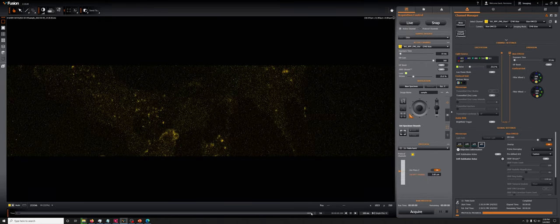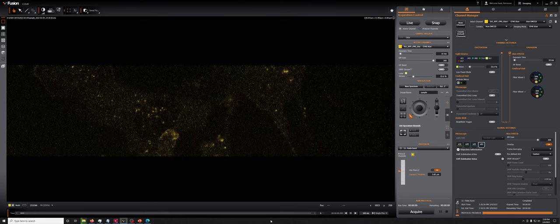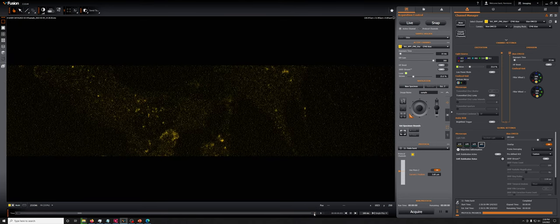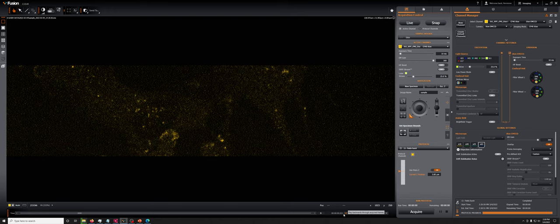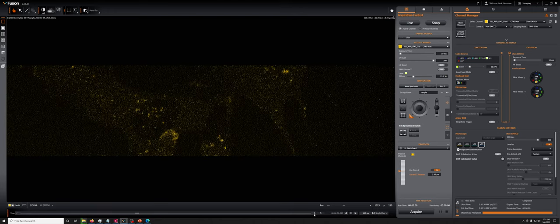you can see that there was very little extra time, essentially one extra millisecond between frames.